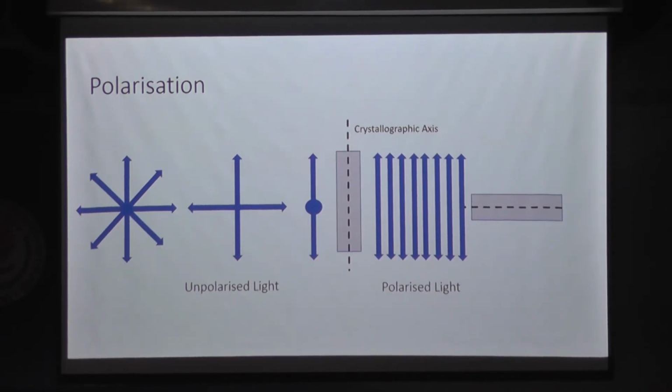Now what happens if I place this as a polarizer? There is one more component which is similar. The same object, a second object, is placed perpendicular to this axis, then you can see nothing is passing after that. One is the polarizer, the second one is the analyzer. These are the same components. One acts as a polarizer, the second acts as an analyzer. If I place them perpendicular, nothing passes. And this is why we use rotating stages for polarization to be impactful. So now when polarizer and analyzer are placed together in the microscope, nothing is coming out.